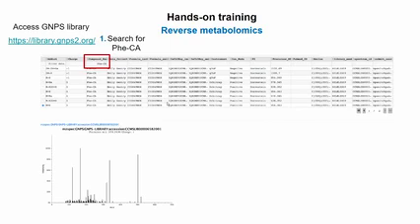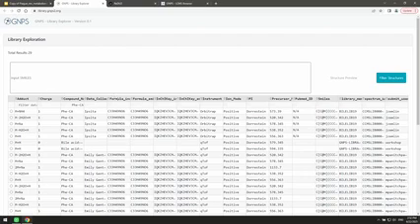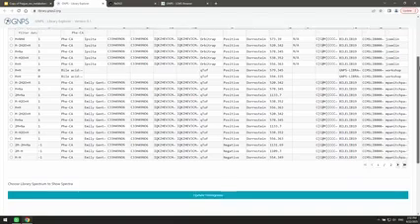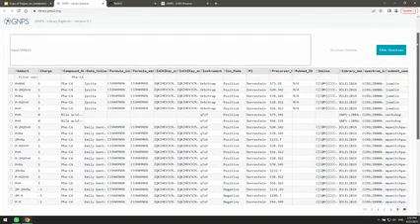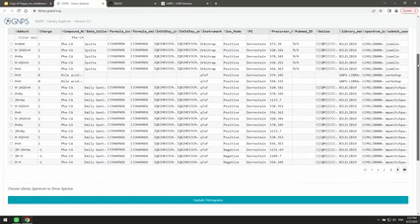I guess everybody is following. So here you will see this kind of window. If anybody does not follow, you can also just raise your hand. We are enough people, we can just run around and help you on your computer. Did everybody get here? Okay, good. If anybody needs help, you can just raise your hand, and one of us could go and help there.